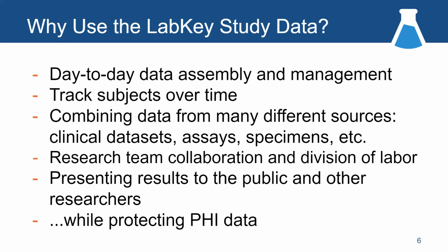Because ultimately what you're doing here is you often have a control group and then another group that you have somehow changed, or you've maybe given them a treatment or something. And you want to be able to track those two groups against one another over time and see their performance changes.